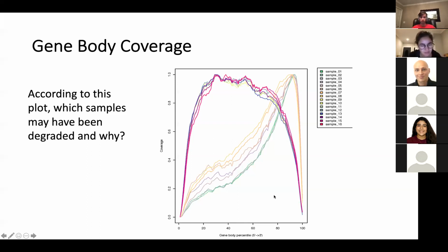Yeah, it's probably not a good sign if, looking across all genes, towards the 5' end you don't see many nucleotides in that transcript. That might indicate that you have some sort of serious degradation going on. What you want is a flat, even coverage across all the genes, at least in the middle section of the gene. And so these are what you're looking for on the gene body coverage plot.